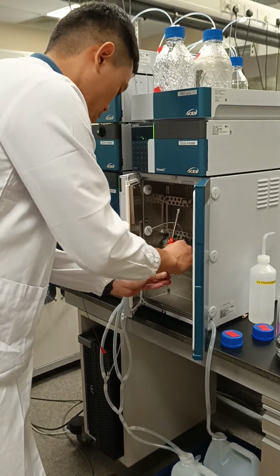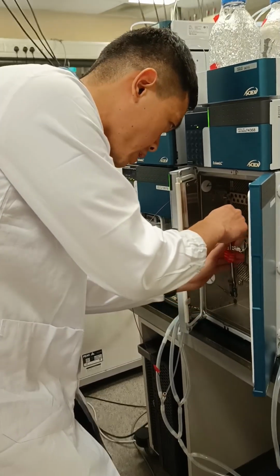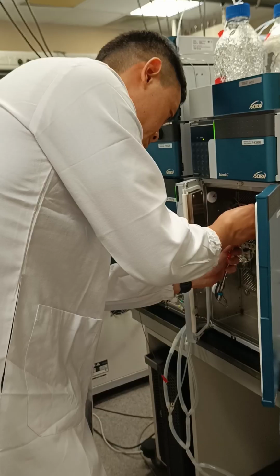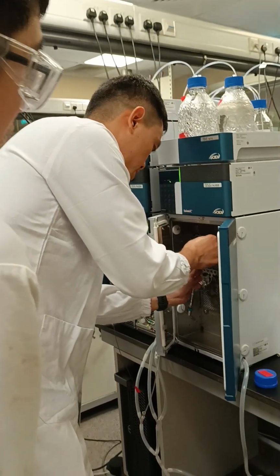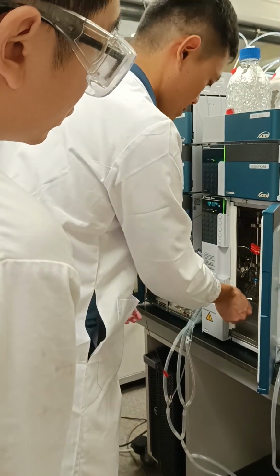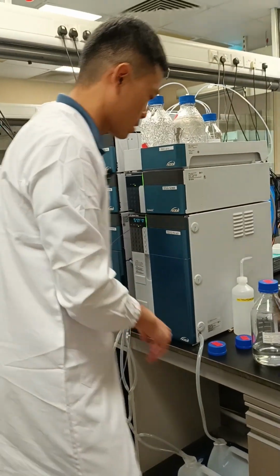And this one, try to make sure it's firmly connected so that there won't be any leak. But eventually, if there's any leak, the system will give you some alert as well, so don't worry about it. But just to make sure it is tight. Okay? So now it's pretty much done for installing the column.